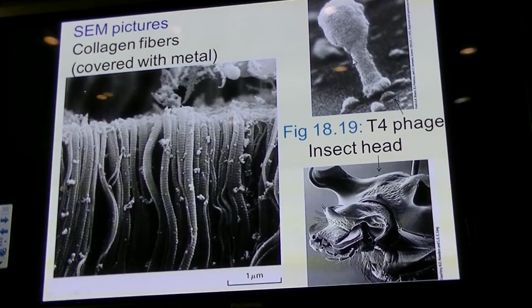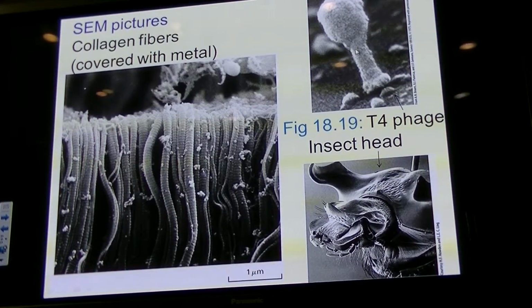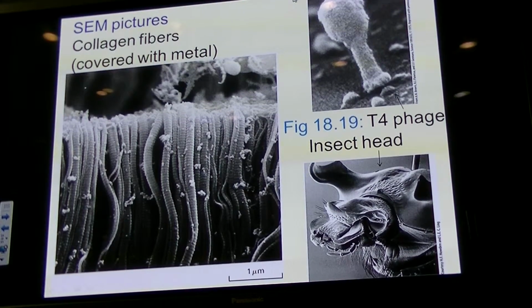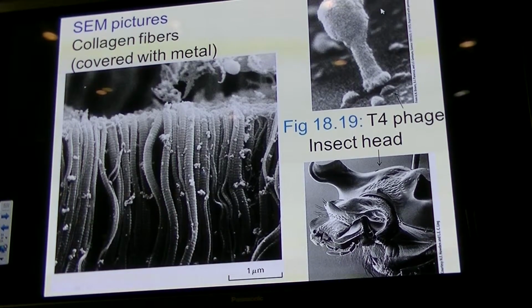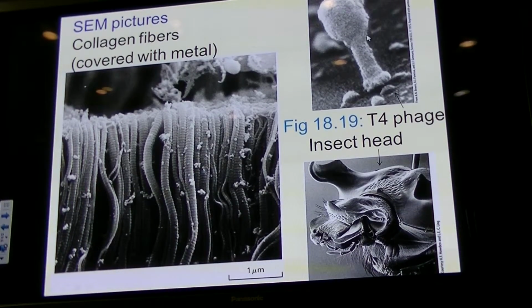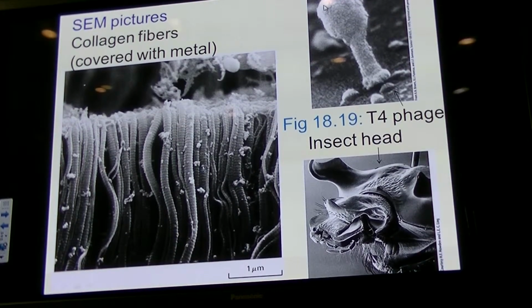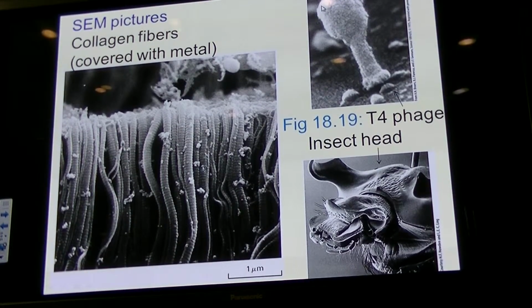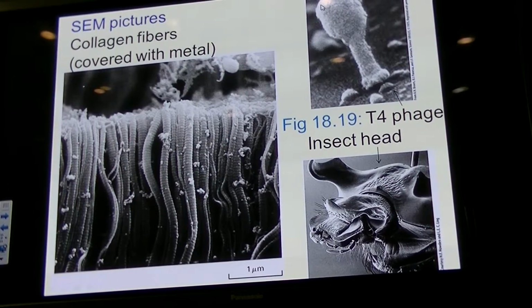What did you say? Because it seems as if we have snapped a picture here of an object that was illuminated from the top left. So that's the position of the detector. Electrons that hit on this side of our bacteriophage have a lower probability of reaching that detector. Not so bright, not so much current. Electrons that were kicked out by the primary beam here, where I'm right now with my cursor, have a high probability of reaching that detector.